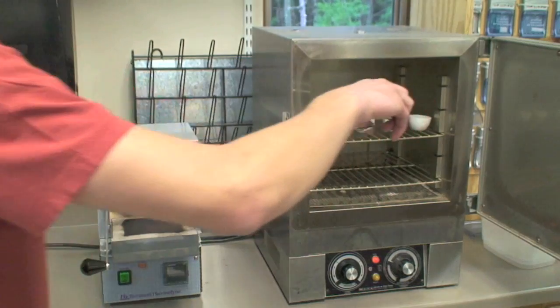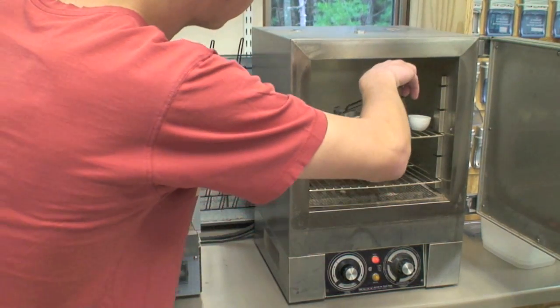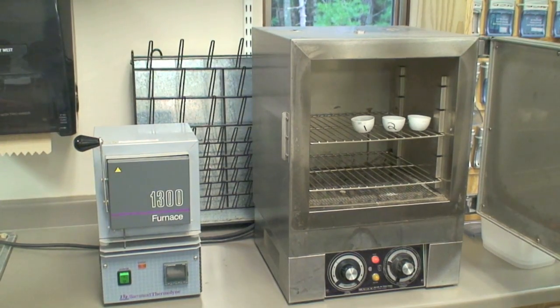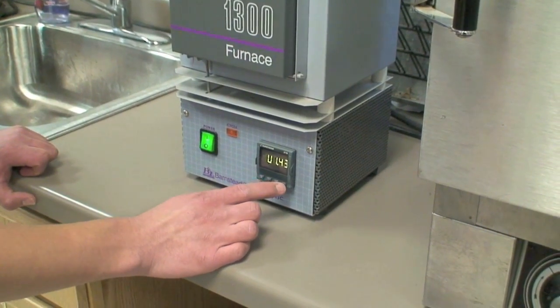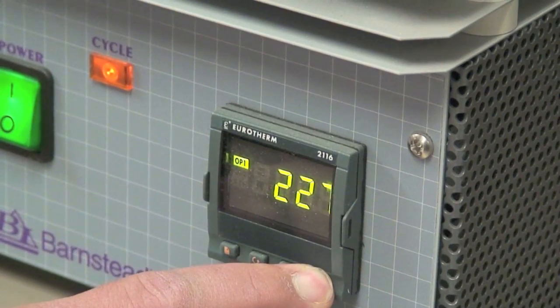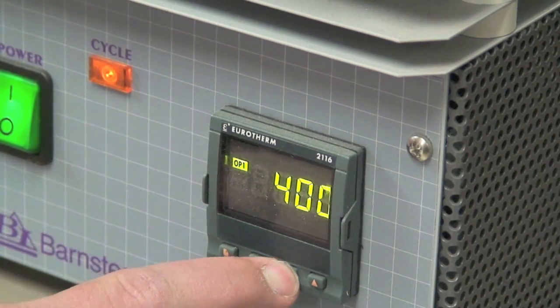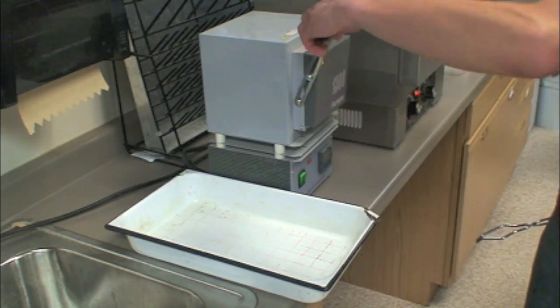To calculate how much organic matter is in your soil, you first need to burn it away by putting the crucibles in a muffle furnace. The furnace should be set to 400 degrees Celsius. After three hours, carefully remove the crucibles from the muffle furnace.